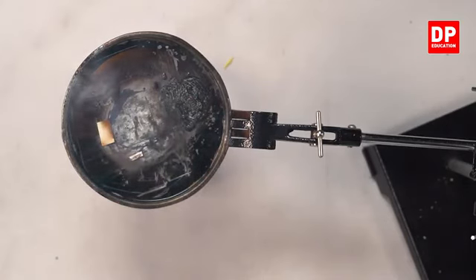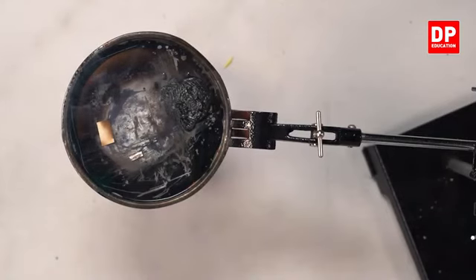The magnesium piece is still in contact, right? There's no change in the magnesium piece still. So the magnesium piece is the remaining one in this experiment.